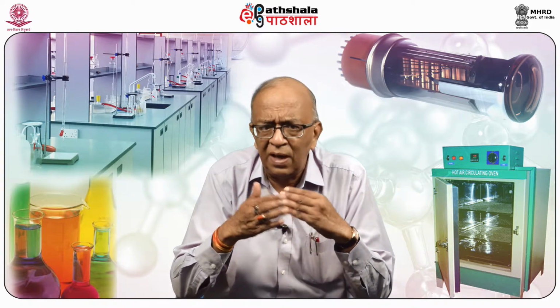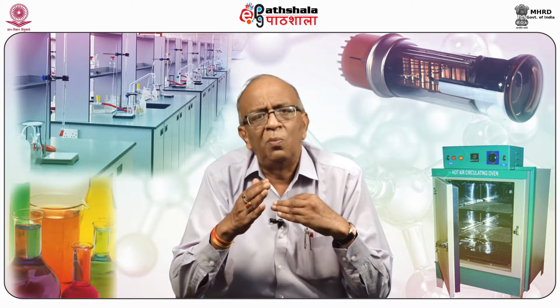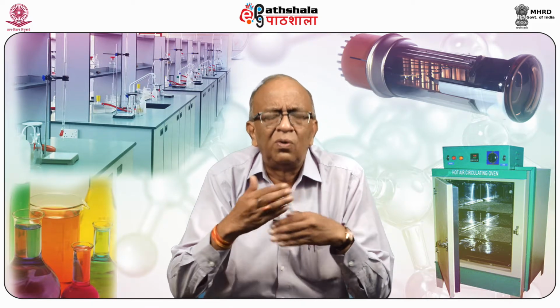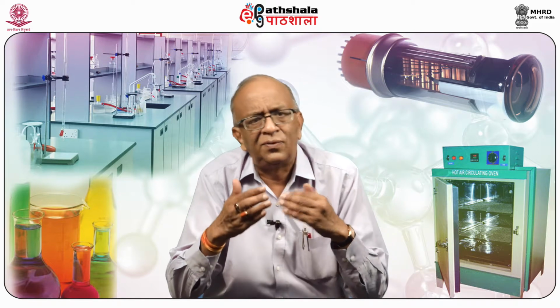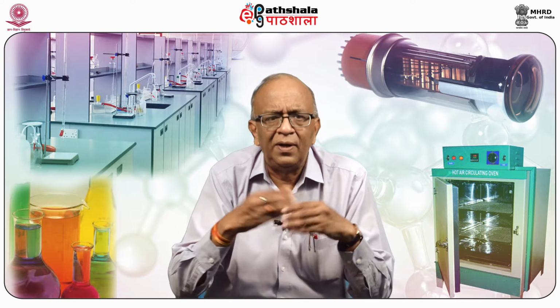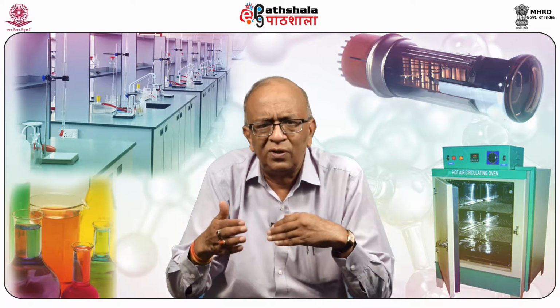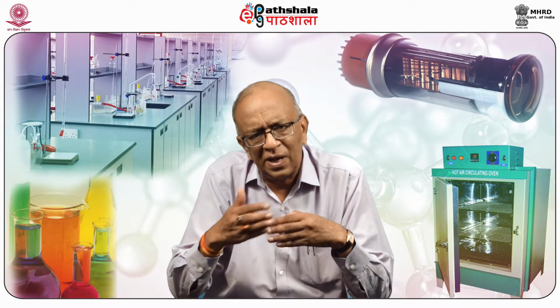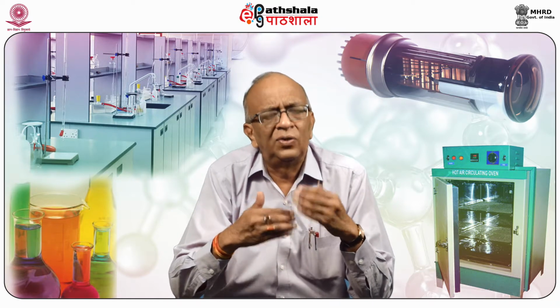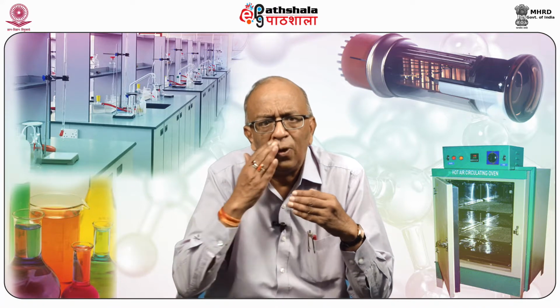On heating, we use a very sophisticated balance, a thermobalance. On the thermobalance, every time we note the change in mass with temperature, because when we heat, mass will decrease. Some water vapor may evaporate, some decomposition may take place. So every time after increasing the temperature, or thermal effect, we will measure the change in the form of mass.